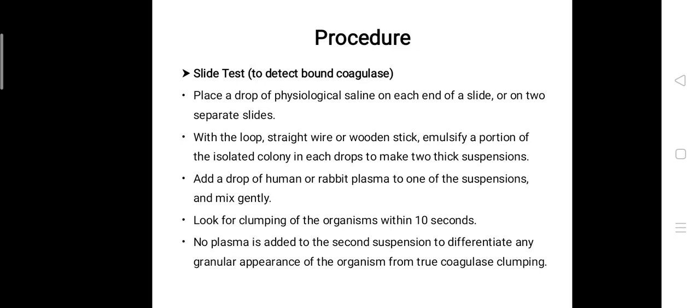When you have emulsified the colonies in the normal saline, the emulsified colonies should look milky white in color. After that, you have to add a drop of human or rabbit plasma to one of the suspensions and mix gently.